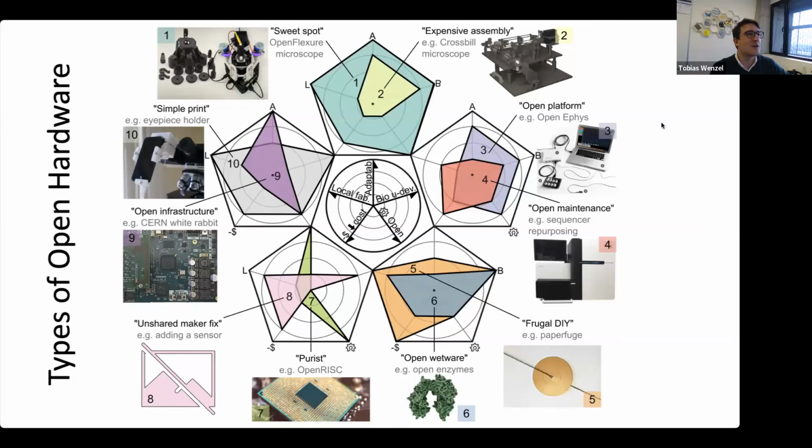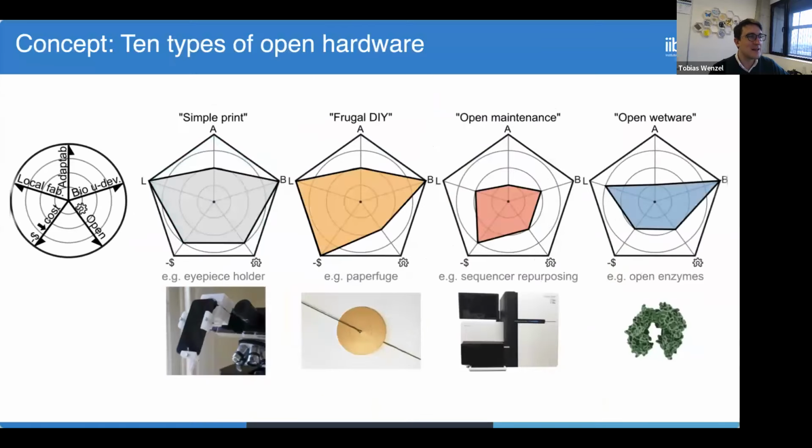Now I'm aware of many, many different kinds of projects, but not all of them achieve this access to technology globally that I'm talking about. This is why I try to categorize, I would say even stereotype, different kinds of projects, giving some examples to show what are approaches that I perceive in the community to build open source hardware, and which of these are really appropriate to provide access to laboratory equipment globally. So let's jump into some of these categories that I created and look at the parameters that I picked for the study.